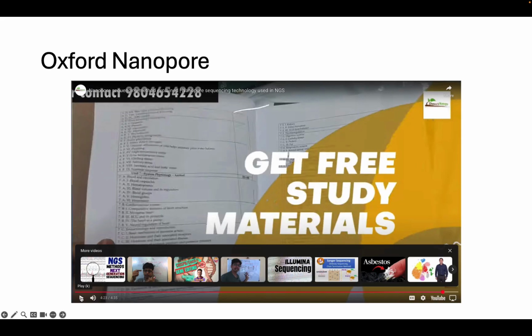So you might ask, well, didn't you tell us a little bit ago that Illumina is kind of like the gold standard for sequencing, is what everybody does? It is. But not because it's necessarily better, but it is a lot cheaper. Doing Nanopore and even PacBio sequencing are still relatively expensive and a little bit out of reach still for a lot of researchers, myself included. We can only do PacBio, and we only do PacBio when we're looking at eukaryotic genomes. And again, it's not cheap.